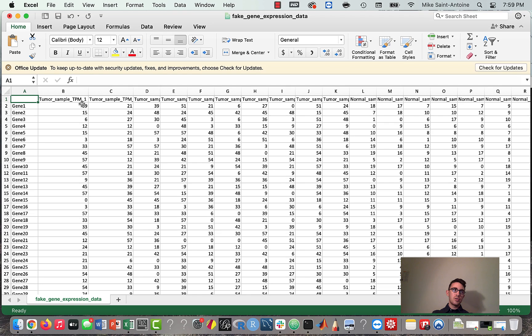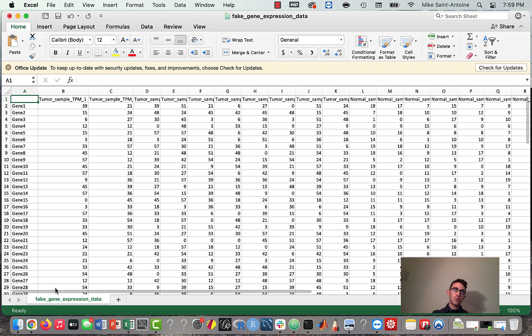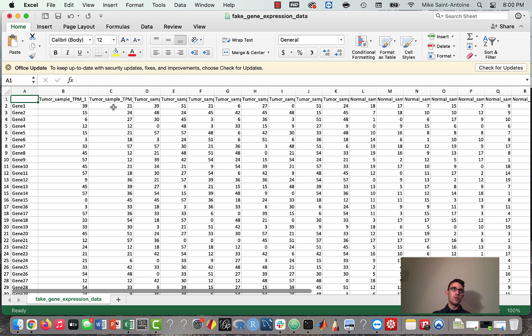I call this TPM — TPM stands for transcripts per million. This is a type of normalization technique used on RNA-seq data, which means out of every million RNA molecules that were counted, how many came from each one of these genes. I want to emphasize that you want to make sure you have normalized data before you start doing this heat map analysis. For now I'm just assuming we have some spreadsheet of already normalized data to work with.